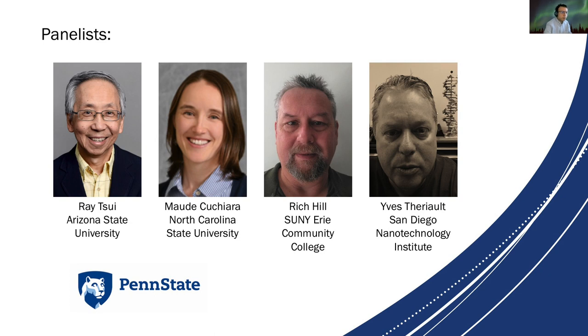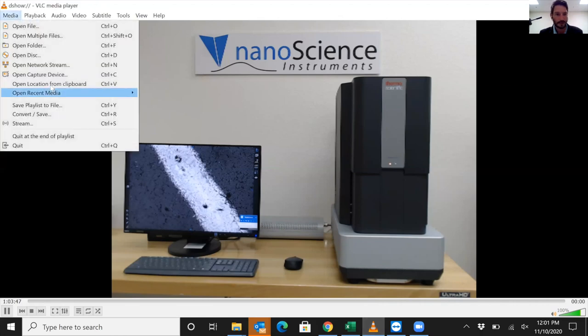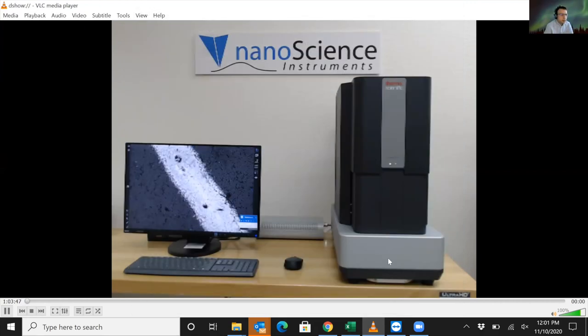Right. And people were interested in the compactness of your system. They were asking, where's the vacuum pump in there? I'll show you guys where the pump is. It's just a small red diaphragm pump, a little mechanical backing pump. So I'm going to go ahead and show you guys around. What TORR level does it pump down to?